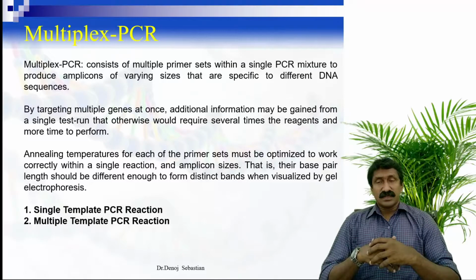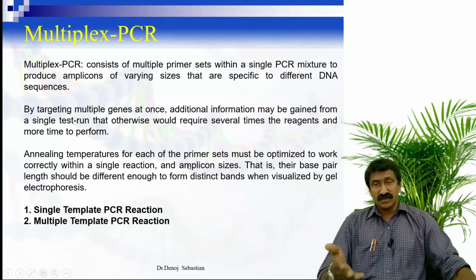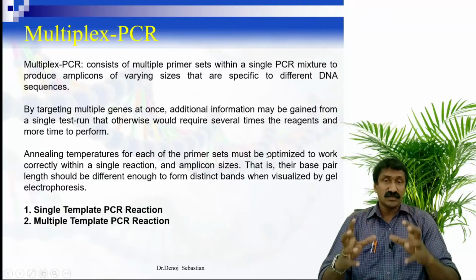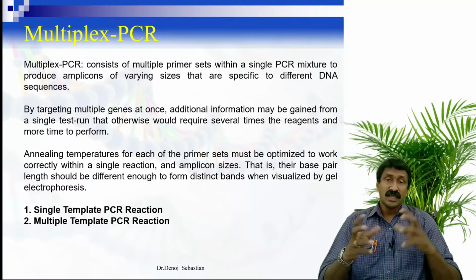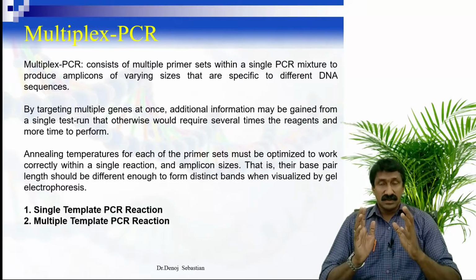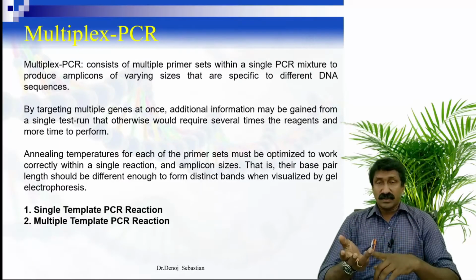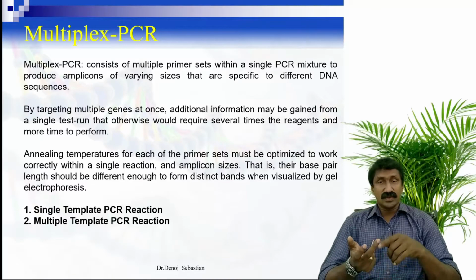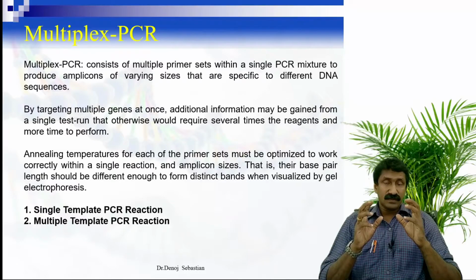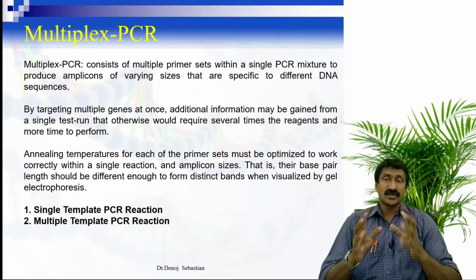In the last paragraph, we explained that multiplex PCR is dependent on the nature and quality of the primer, and also on the amplicon size. I will explain it a little bit. You know that the primer quality depends upon the GC content and its Tm value, or the melting temperature, and other properties, such as the overall length of the primer. All these affect the Tm and the annealing temperature of the primer.